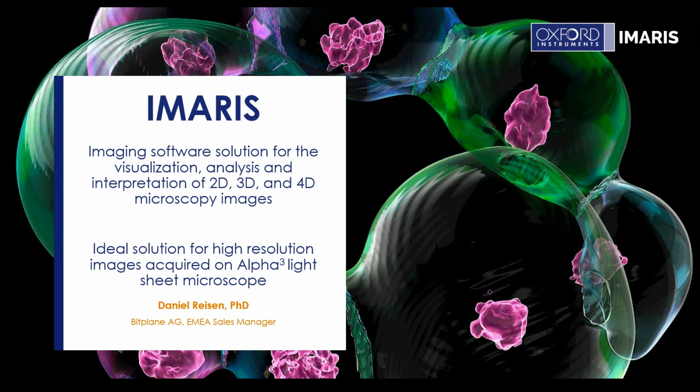And during this talk, I will present you Imaris, an image software solution for the visualization, analysis, and interpretation of 2D, 3D, and 4D microscope images. During this talk, we will focus on that software to show you that it's an ideal solution for high-resolution images acquired on an Alpha3 light sheet microscope.